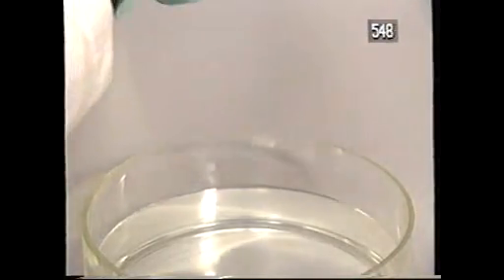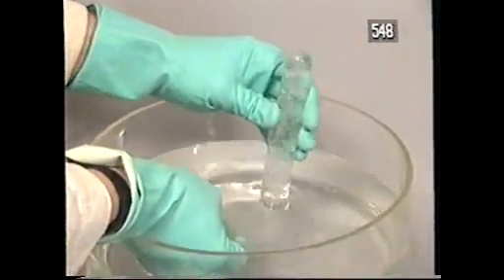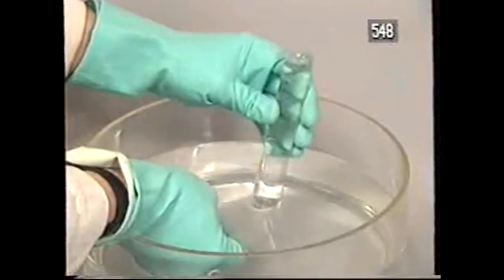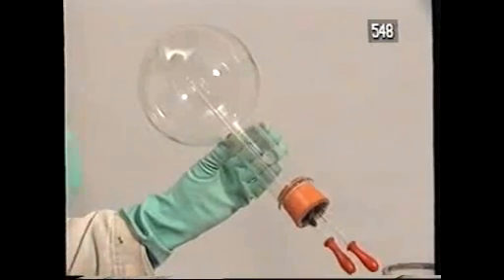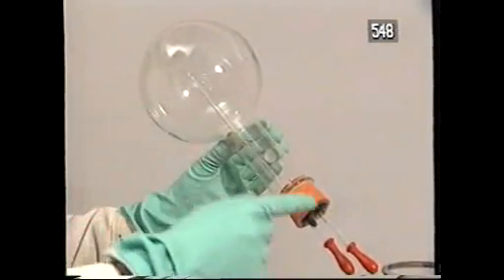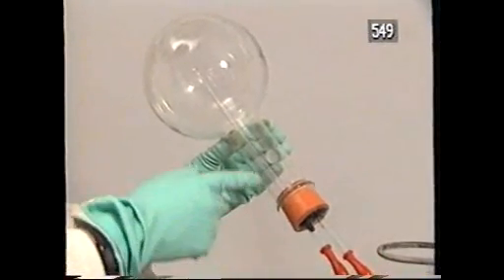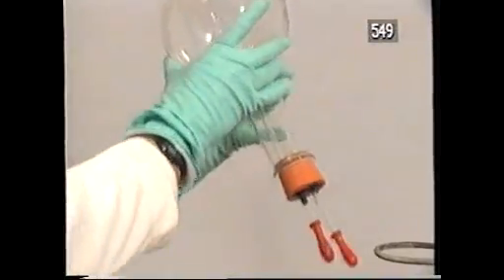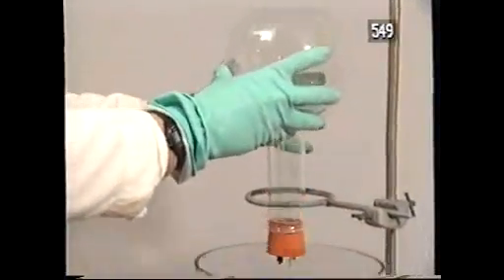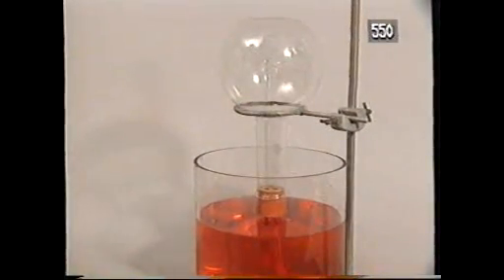Let's find out how soluble ammonia is. The water rushes in. Ammonia is very soluble in water. Here's a more exotic way of demonstrating that solubility. I filled this flask with ammonia and sealed the filling tubes with rubber teats. One of the tubes is a long one and goes right up into the bowl. I'll invert the flask in a tank of red litmus and remove the teat from the long tube.